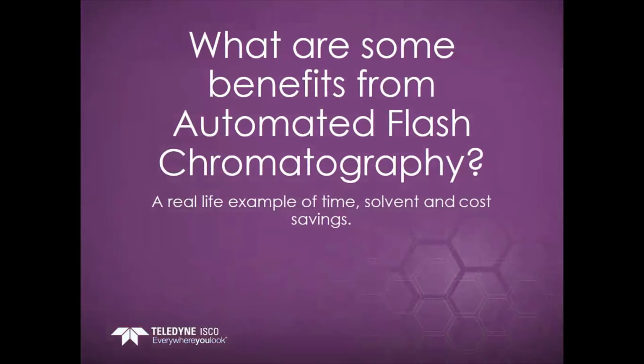So the next section here, we're going to talk about some benefits that you can gain from using automated flash chromatography. We're going to go through a real-life example that shows some time, solvent, and cost savings. This is an old example, but it's a very good illustration of how the automated flash system saves you time, solvent, and cost.